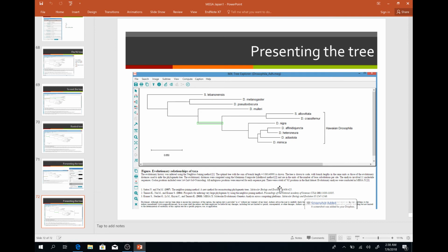There is another option for alignment other than Mega, and that is a program called Guidance. It's a web-based program. When you ask yourself, I've got this alignment, how good is the alignment? There's no internal way to answer that. What Guidance does is take your alignment, evaluate it, and color various regions according to the quality of the alignment of that region.